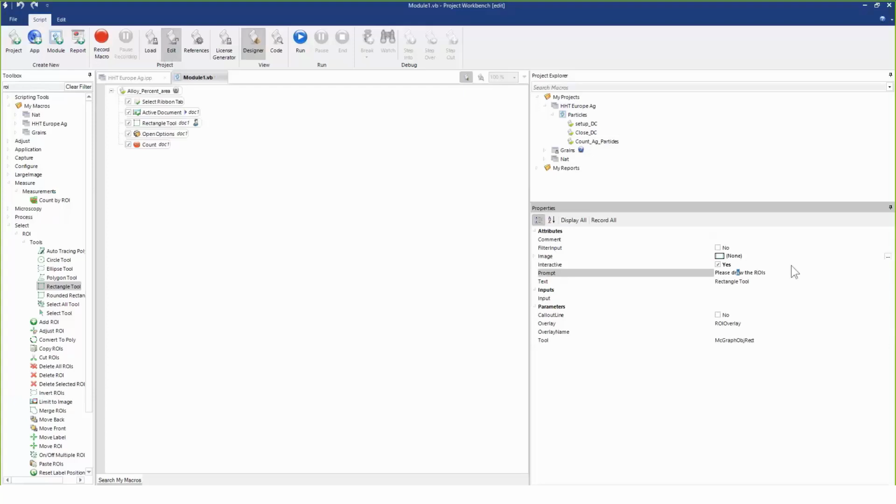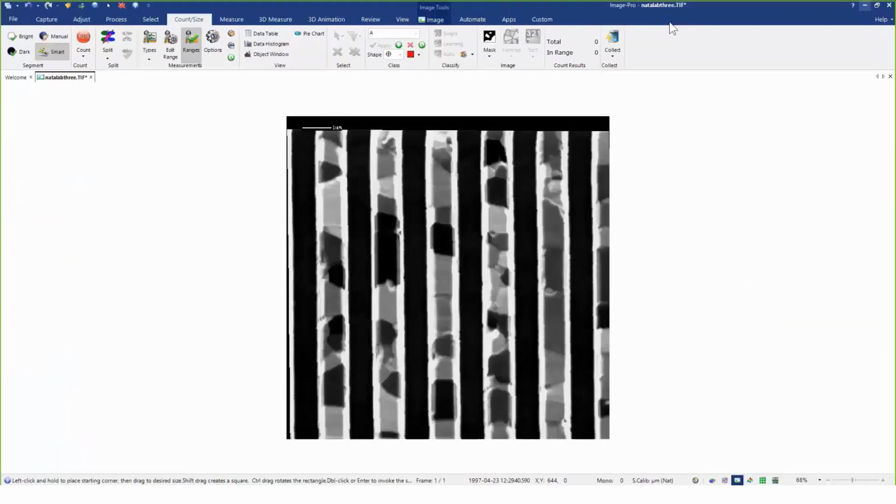Sometimes, again, this is personal, I'll just double check to make sure that that's sticking. Oops, I turned that off by accident. Input document 1. Usually I go back and forth just to make sure I have, oops, there we go. Document 1, have to load it, and now let's run it.